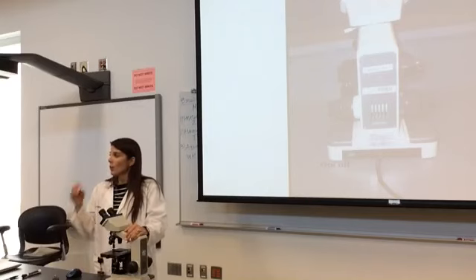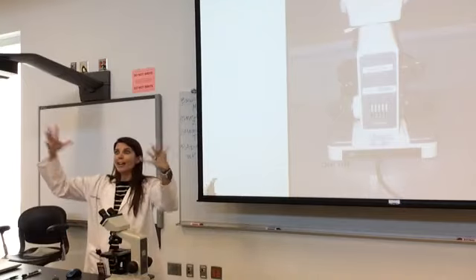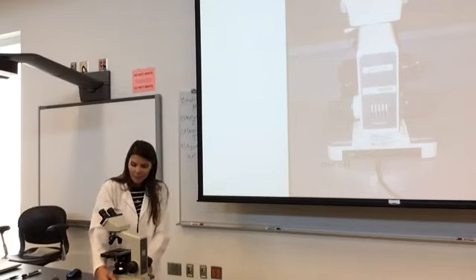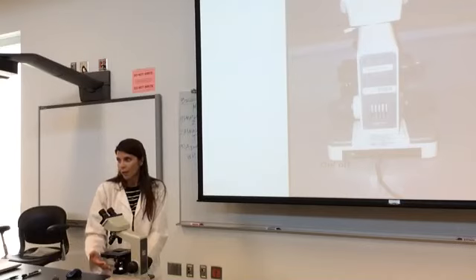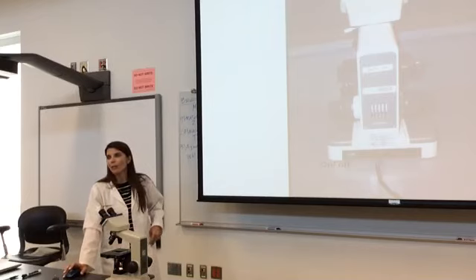If you are sensitive to light and it triggers headaches, you can use a soft light. And if you want a really bright light, then use a lot of light. You can change that back and forth so that you can see your specimen. So you've turned it on, and you've used the rheostat to change the amount of light that gets through.